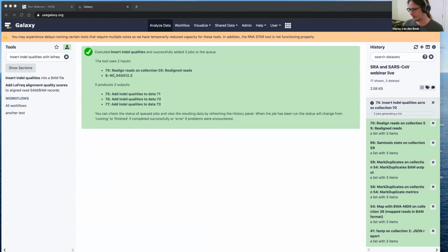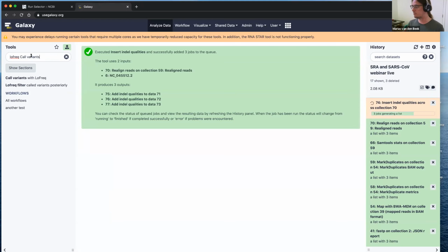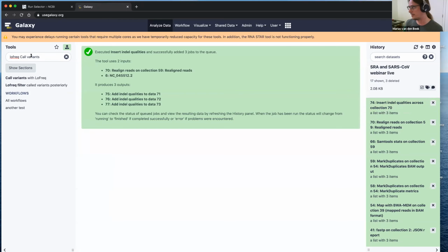And with that, we can finally do the actual variant calling, which we do with Call variants. You see that LoFreq has multiple discrete steps in the preparation of the input data sets. You can find more information on the COVID-19 portal where we describe in more detail why we've chosen to use LoFreq for calling variants on the SARS-CoV-2 sequencing data.